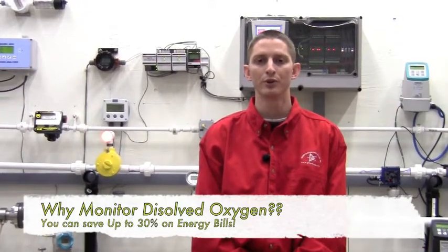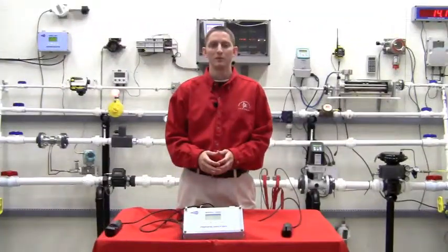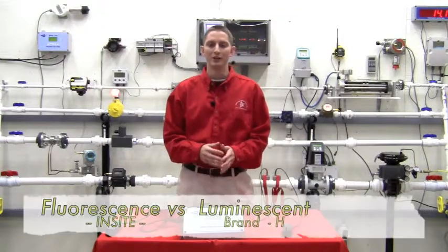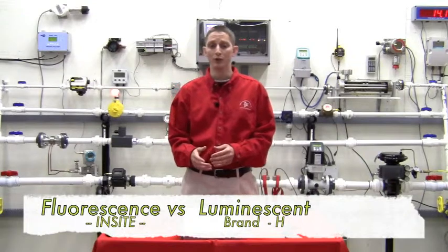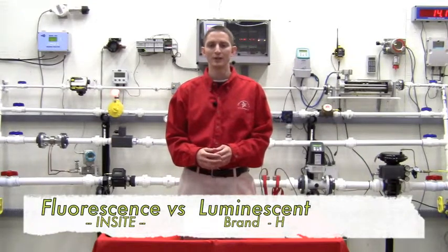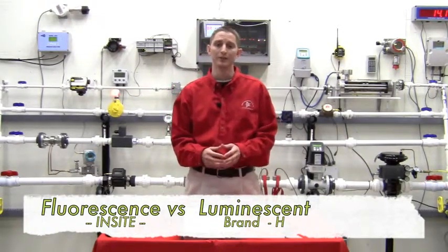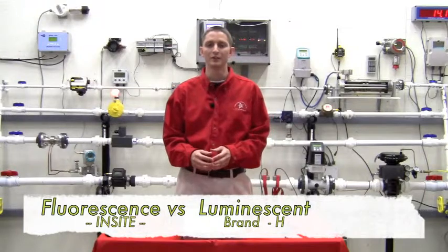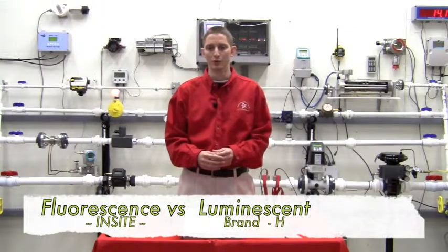The major difference between Insight's fluorescent technology and the competition's luminescent or LDO technology is that fluorescence is the measurement of the immediate reaction of a material in response to an excitation energy source, while luminescence is the measurement of the time it takes the material to recover after the excitation energy source is removed.